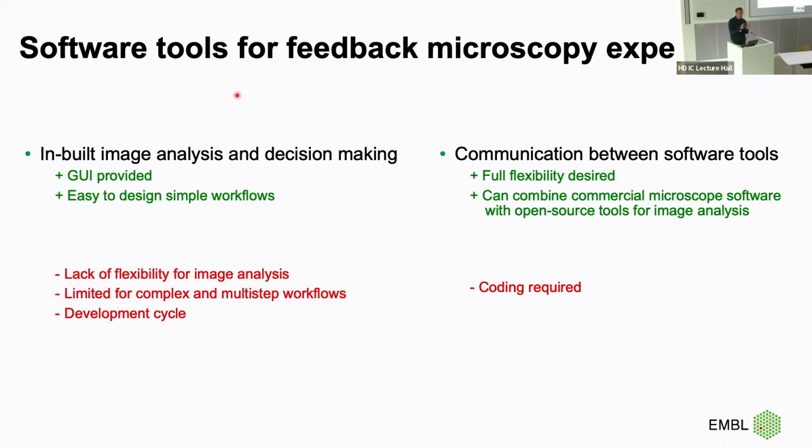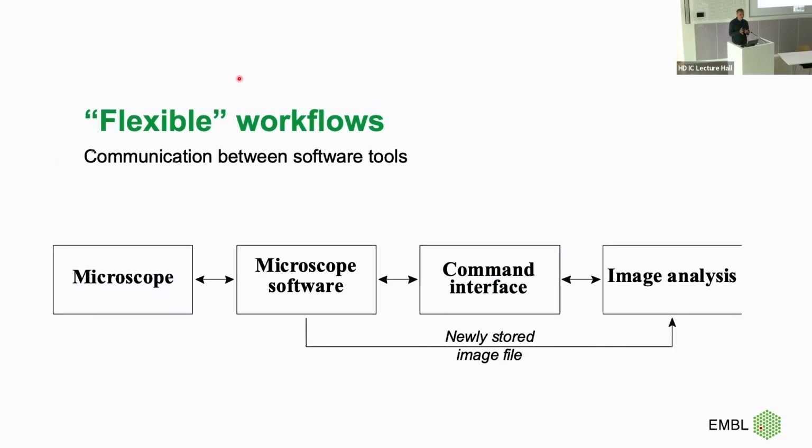So before coming to how we would do it in our case, because it's not only we doing that, it's basically a field which has existed for some time, not since yesterday. I want to conceptualize a little bit, because I was talking to different people trying to do similar things. In many cases, I would not say all, we end up in some kind of architecture which in one way or another resembles several modules. Again, now I talk about the framework of a facility when we work with a commercial microscope.